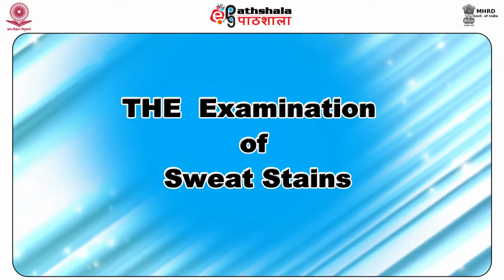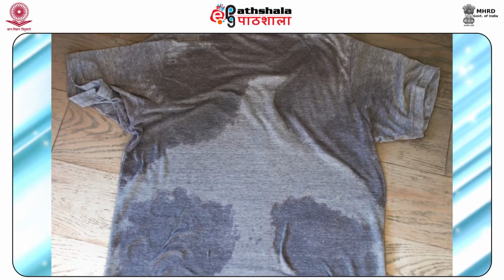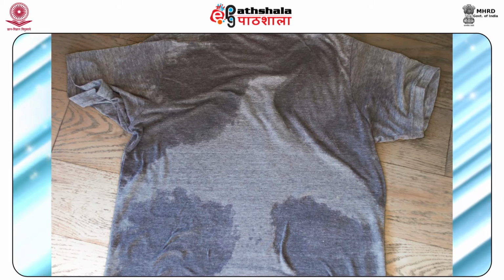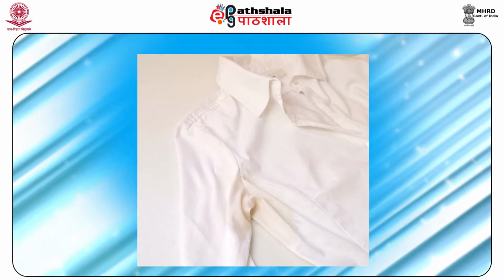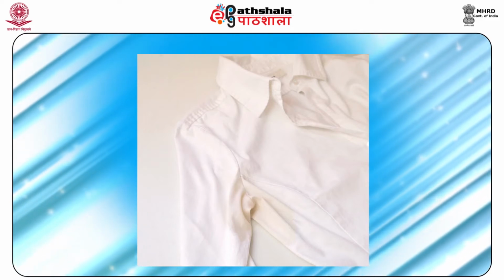Now we will proceed to the examination of sweat stains. Examination of sweat is very important from a forensic point of view to analyze the blood group of an individual from their wearing apparel. The sweat-bearing areas are first examined for the existence of urea by the Guy's urea nitrate test.